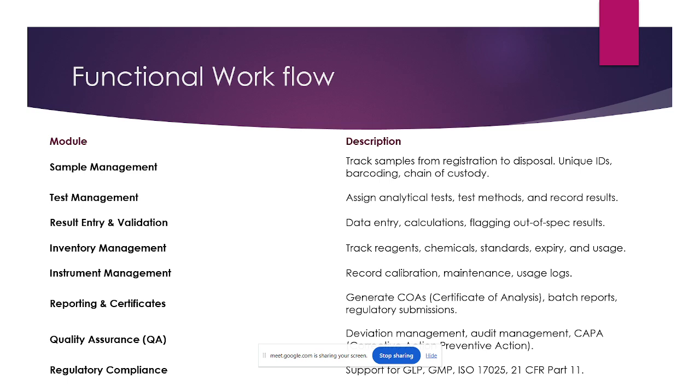Coming to the instrument management module. If you want to do the testing in the lab application, instruments are compulsorily required, because we perform the analysis only on instruments. All instruments require calibrations and preventive maintenance. In this instrument management we can manage the instruments: how many instruments there are, what the calibration dates are, what the PM dates are, and so on.